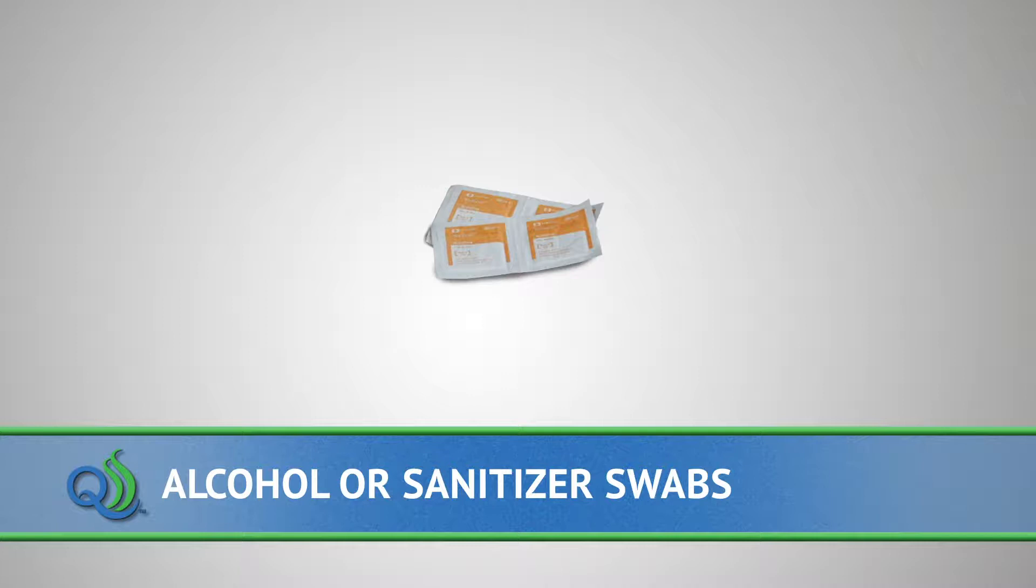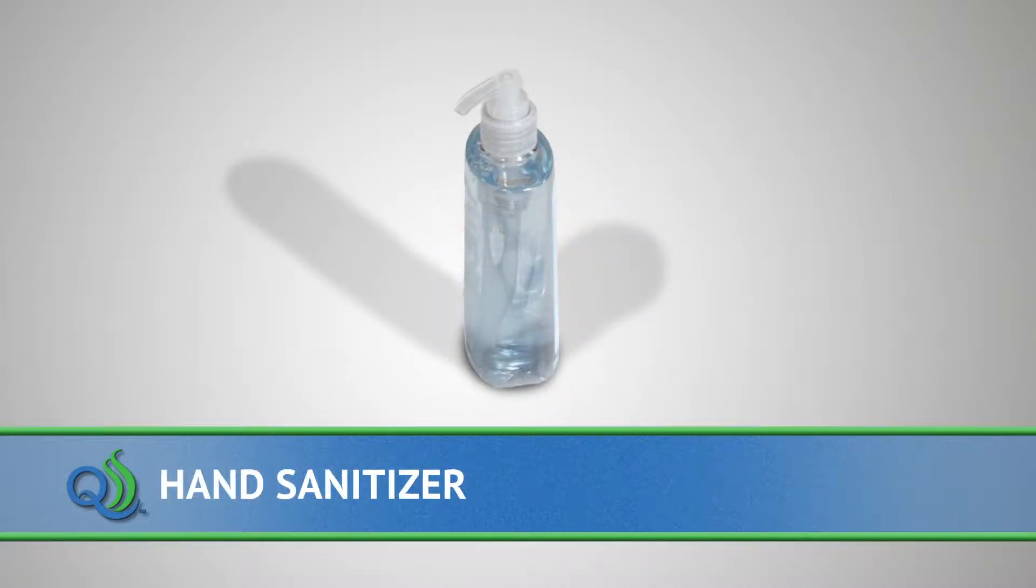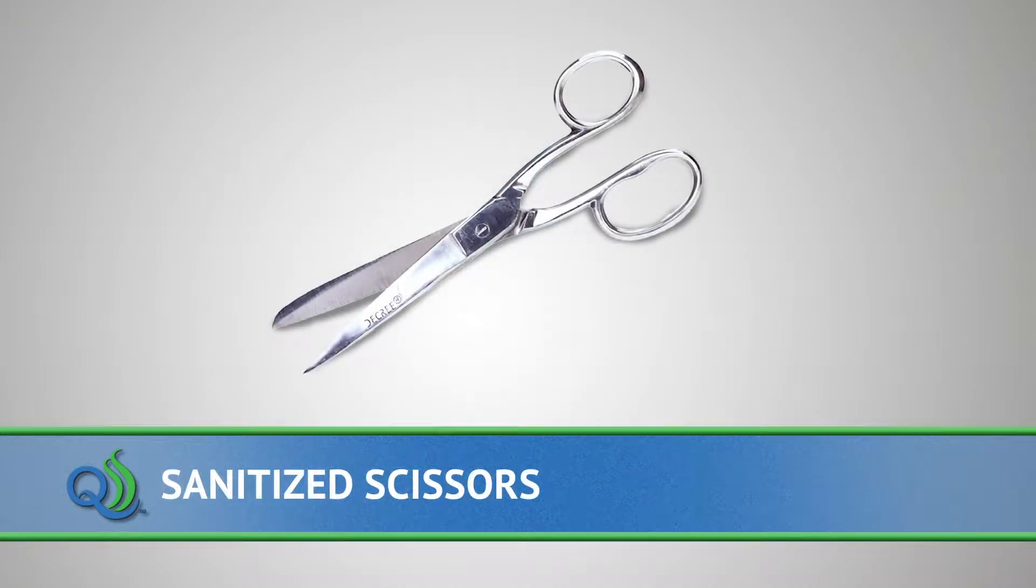You'll also need alcohol or sanitizer for swabbing the inside of the stainless steel port and a separate swab for cleaning the front of the QualiTrue sterile septum prior to needle insertion, hand sanitizer to clean hands before sampling, and a pair of sanitized scissors or other tool for cutting.